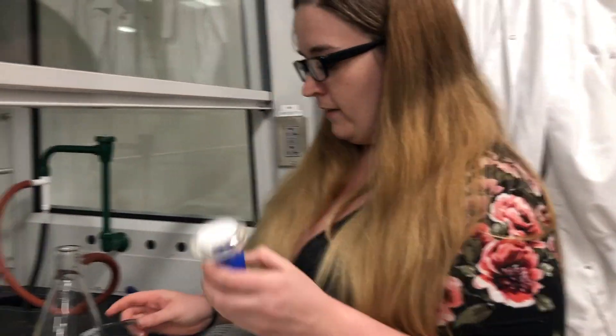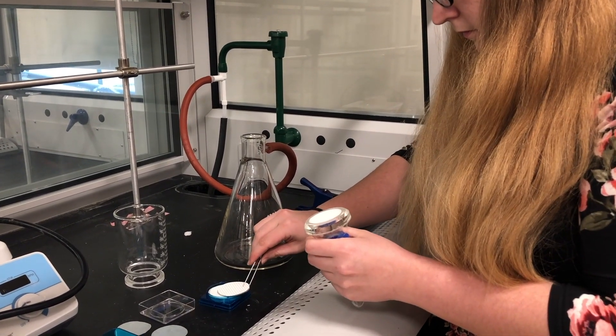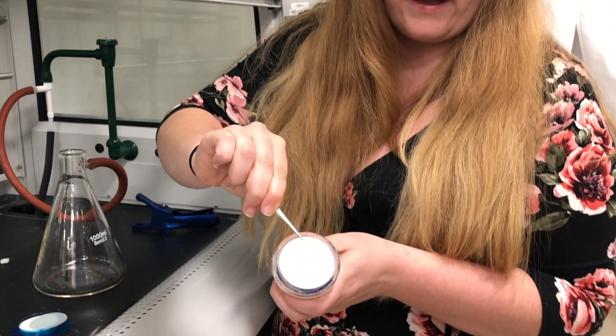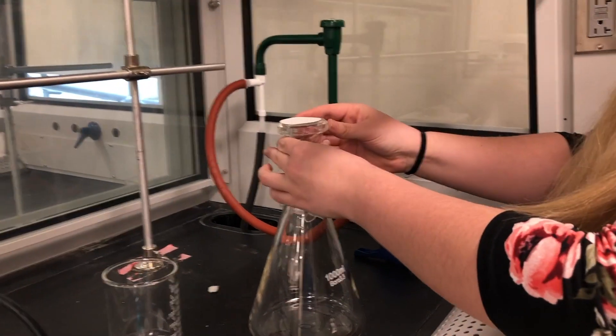You're going to take this piece right here and with tweezers pick up a piece of filter paper and set it on top like that, and then you're going to place this in the Erlenmeyer.